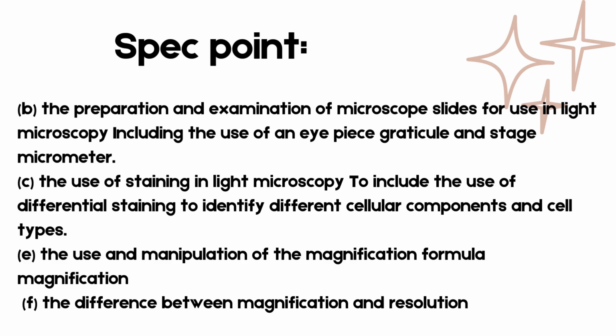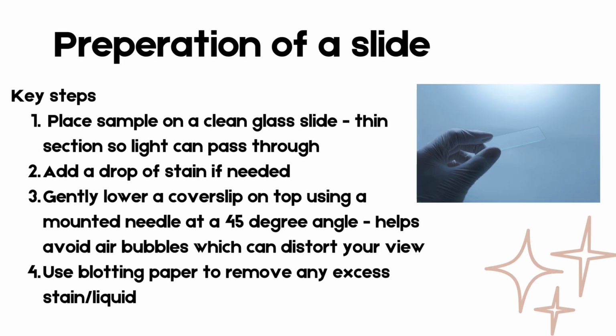Today, we're simplifying graticules and staining. Everything you need to know for your exams and practicals made simple. First things first, how do we prepare slides for the light microscope? You can't just throw your sample on the stage and hope for the best.